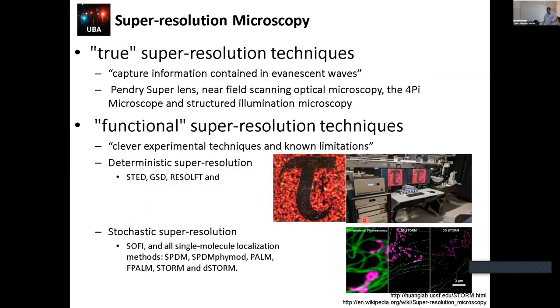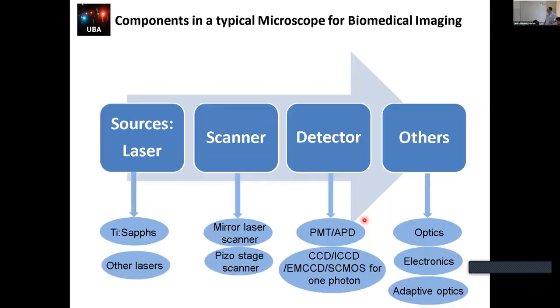In 2014, three people got the Nobel Prize for super resolution, which enabled breaking the diffraction limit. And there are different kinds. I will not cover them today because, as I said before, on Wednesday Fernando Stefani, Luca Lanzano, and Giuseppe Vicidomini will cover in detail all the different approaches, as well as the new things that they are doing.